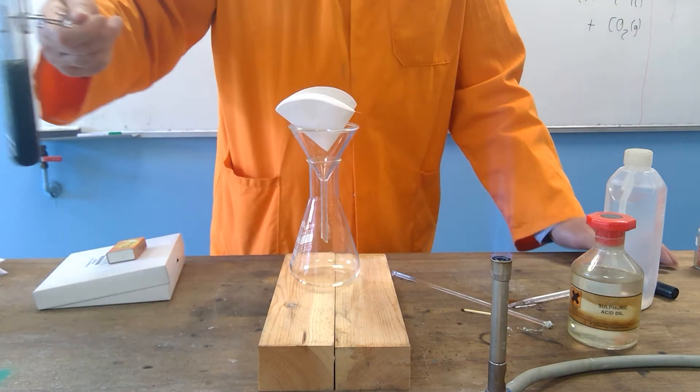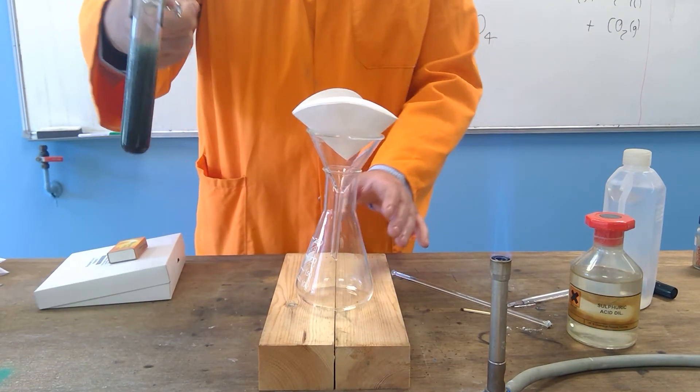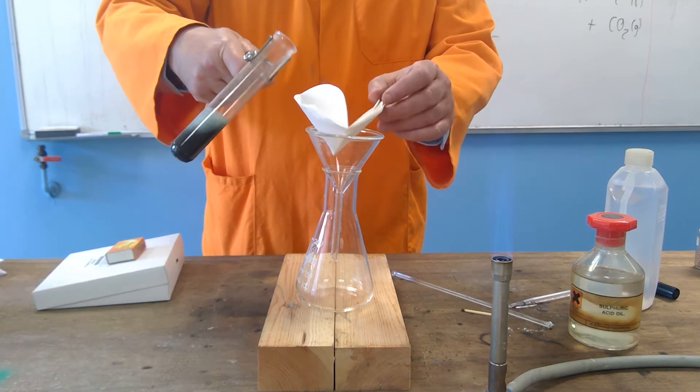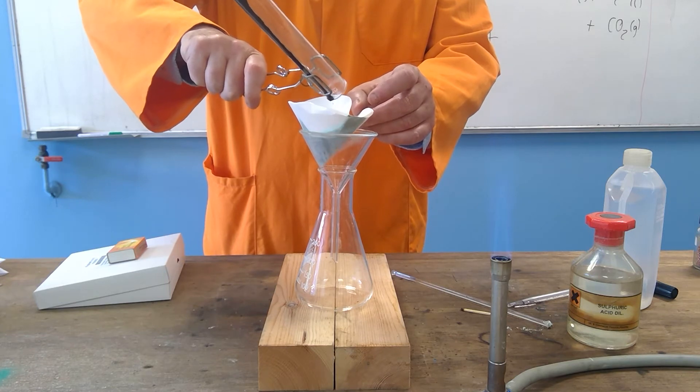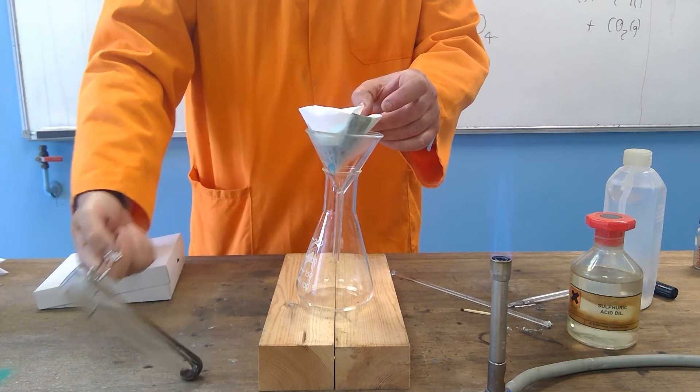So what I'm going to do is I'm going to now filter it, because it's difficult to see the colour, through filter paper into a conical flask. It takes a while to filter.